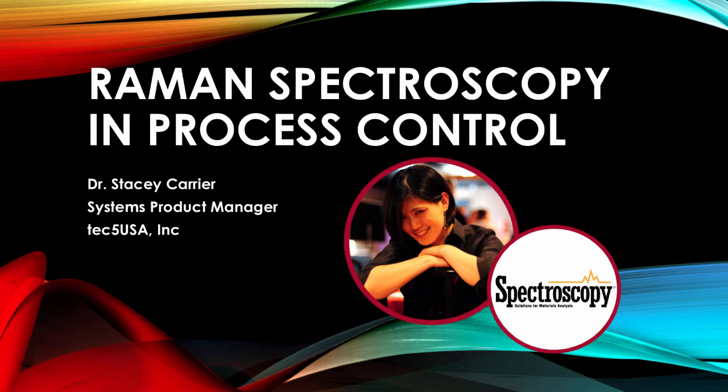For Raman, what we are trying to do is we would like to be able to establish our Raman system within the industries to show that there is a system that can monitor their processes at 24/7 for several months, and give a viable alternative to near-IR spectroscopy.